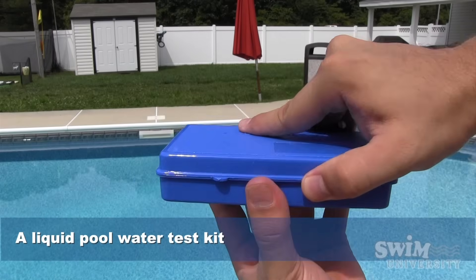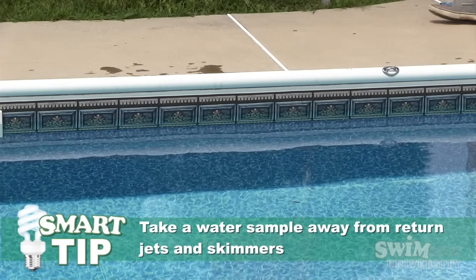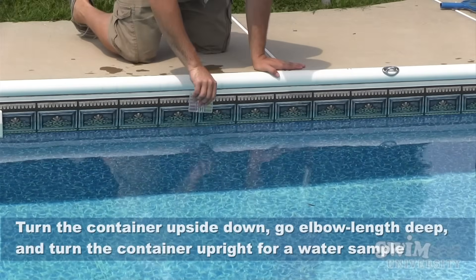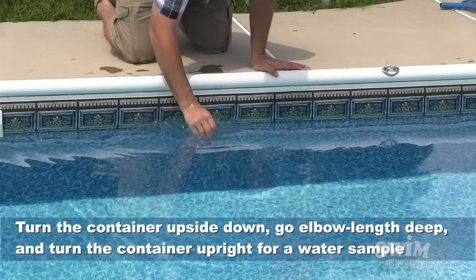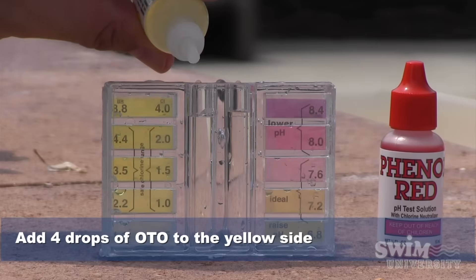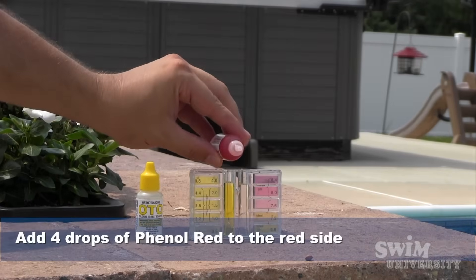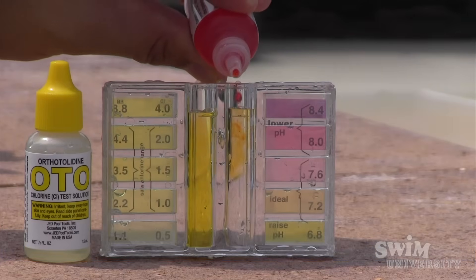All you need is a test kit that checks for pH and chlorine levels. Take a sample of your water with the testing container away from any return jets or skimmers. Hold the container upside down, dip it elbow length deep, turn the container right side up and take your sample. Add 4 drops of OTO liquid in the yellow side of the container — this checks the chlorine level. Then add 4 drops of phenol red in the red side of the container — this will check the pH level.